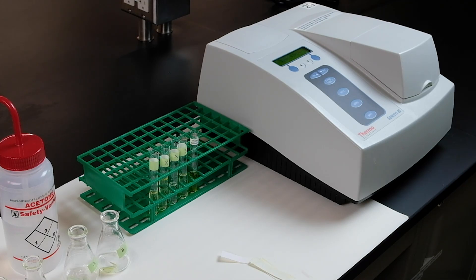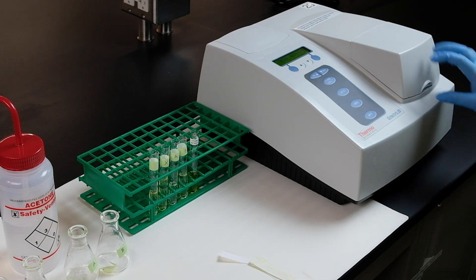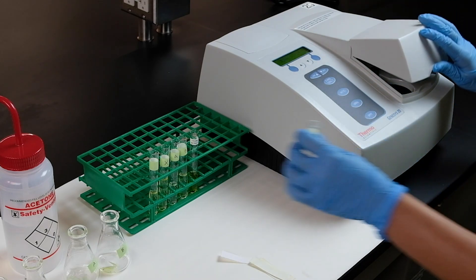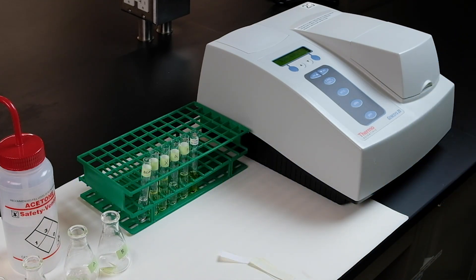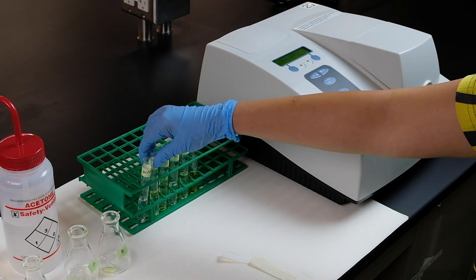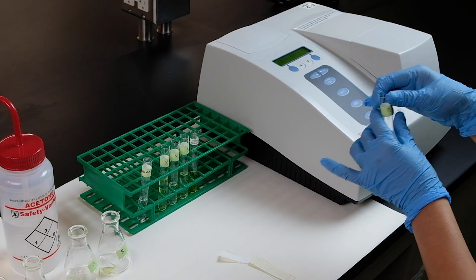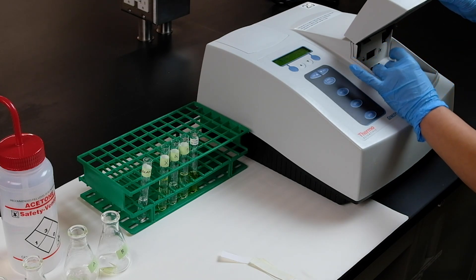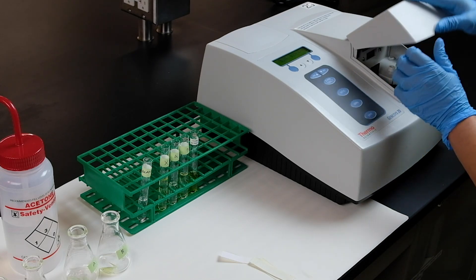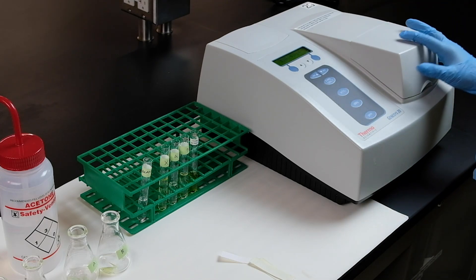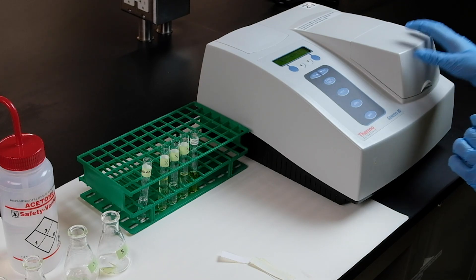At that time, your spec machine will show the value of 0, which means you blanked successfully. Starting with a wavelength of 380 nanometers, start recording each of the readings of each of your pigments. Start with carotene. Record now the absorbance values that the spec machine gives you.